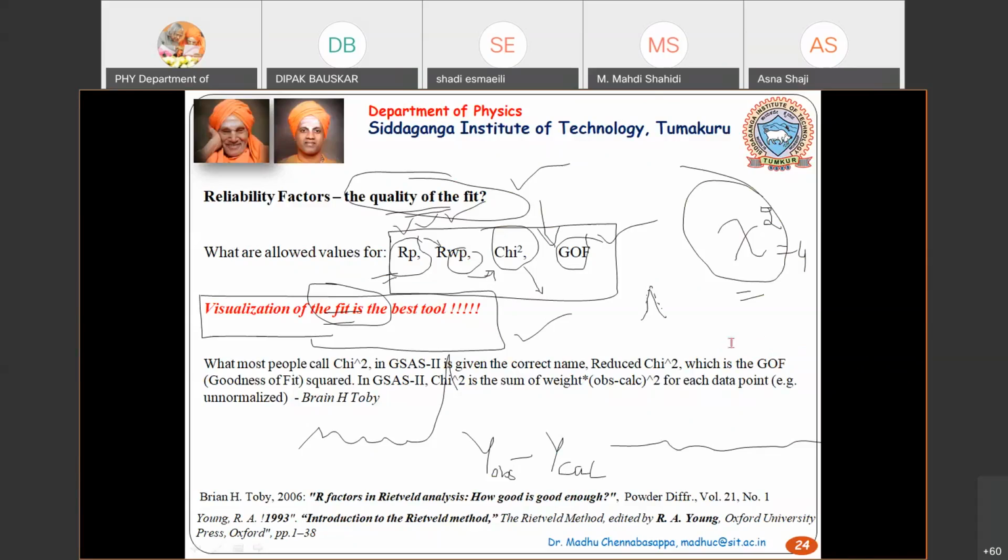So this I will explain to you. When it comes to bar, you just have to put a minus. If it is something like Fm3bar m, then when you write it in FullProf, it will be F m minus 3 m. So instead of bar, we are going to use this minus. This is how we are going to do it. We will take some examples and do it in the next session.